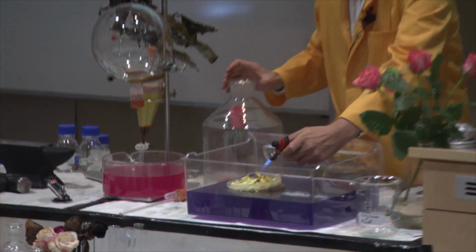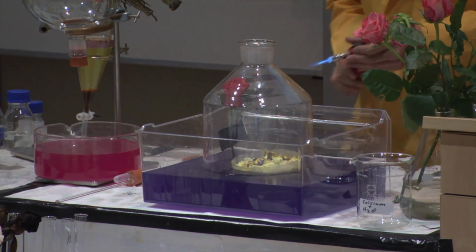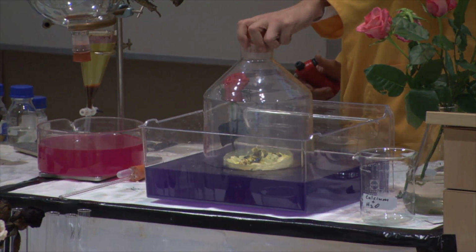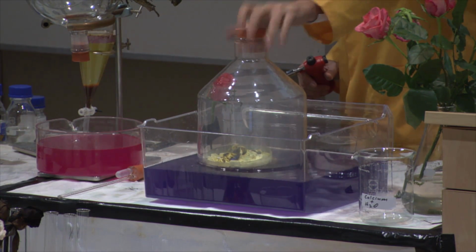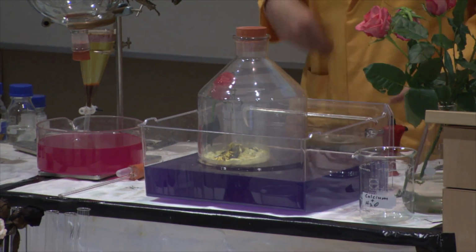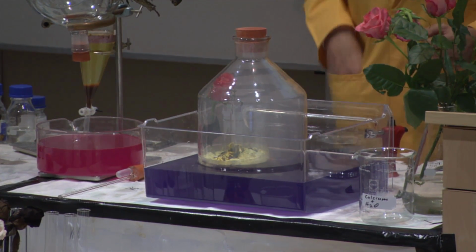Oops. Well, I think it's burning there. And unfortunately, it gives out some rather choking smell, so I'll cover it up. And you'll notice that I've got a rose in there as well. And it's floating on some cabbage water. And this is because there's something I want you to see here. So we're burning the sulfur, and this means that the sulfur is combining with the oxygen from the air.